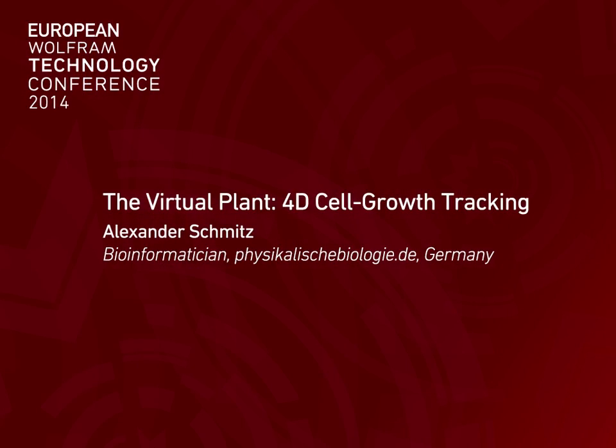What I would like to show you in the next couple of minutes is how we use Mathematica in our group to extract and analyze important biological information from 3D image data. The main topic I'd like to focus on is cell tracking in the development of lateral roots in a plant called Arabidopsis thaliana.